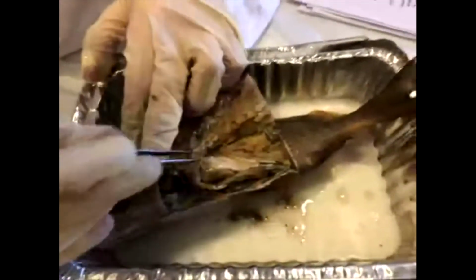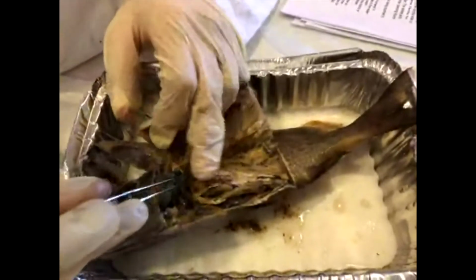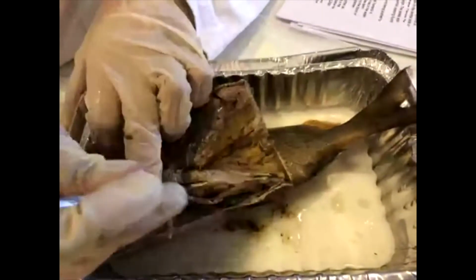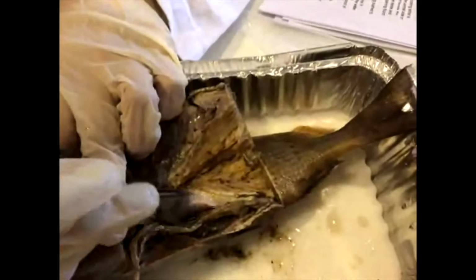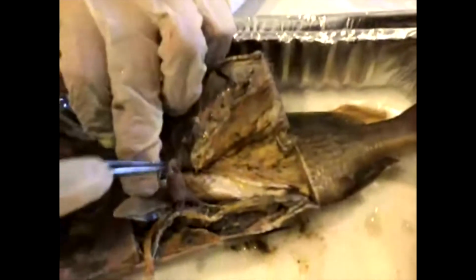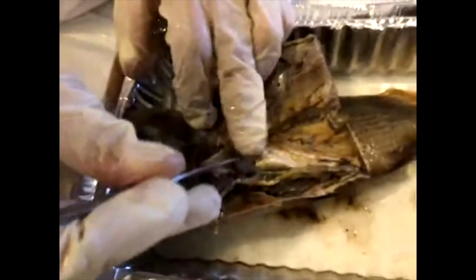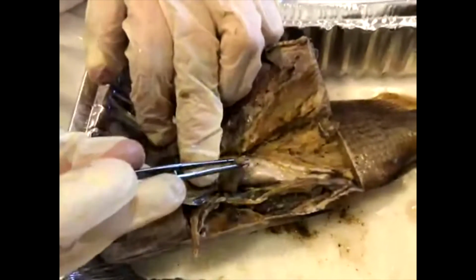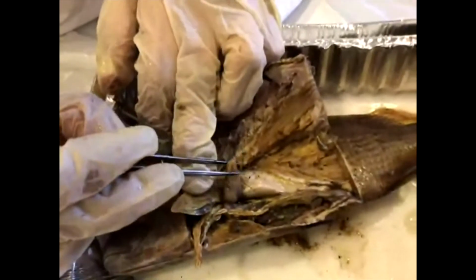So if we go underneath here, we can see the start of the digestive system, which I guess the liver kind of is the start as well, but we've got the stomach in here. And the stomach, on different fish, might have a few lobes like this. They have a different stomach than humans. Our stomach is one big sac. It's about the size of a softball, but it can expand to be about the size of a grocery bag. If you ate a really big meal, I wouldn't suggest it.